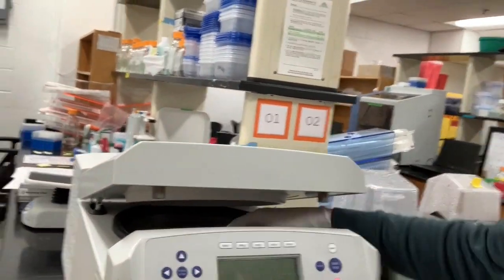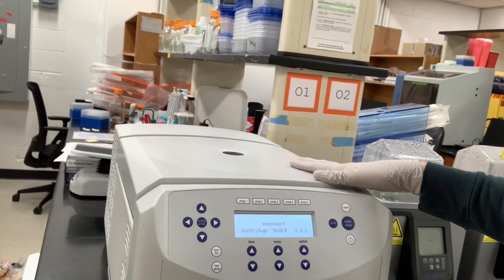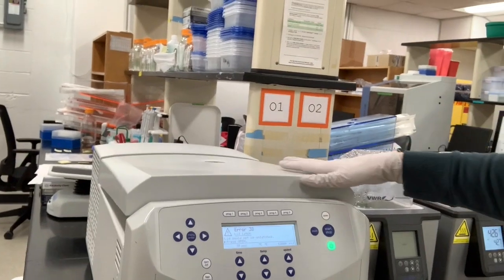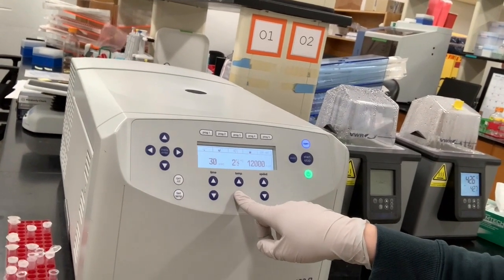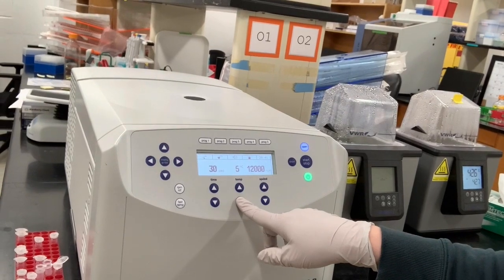And we want it to be at 4 degrees. And it isn't typically at 4 degrees. So if you want to set it that way, you can chill it in advance. It takes a little bit of time. Okay, so I've closed the centrifuge. I'm going to reset the temperature to 4 degrees. This is just to keep those samples cold.